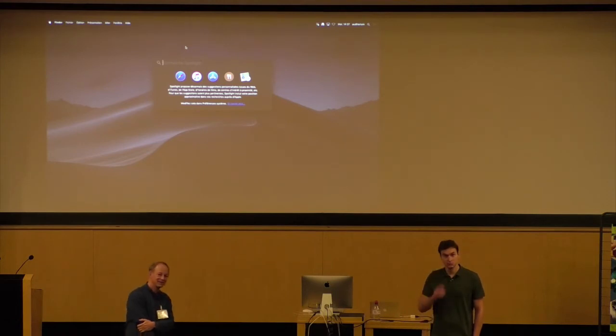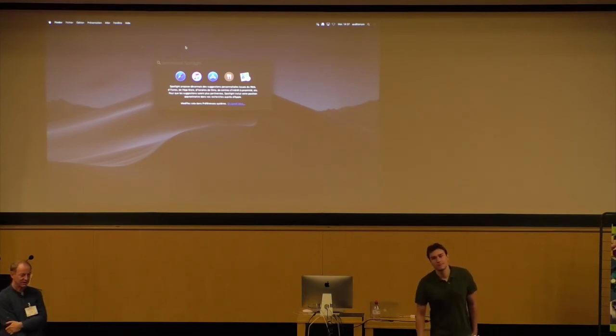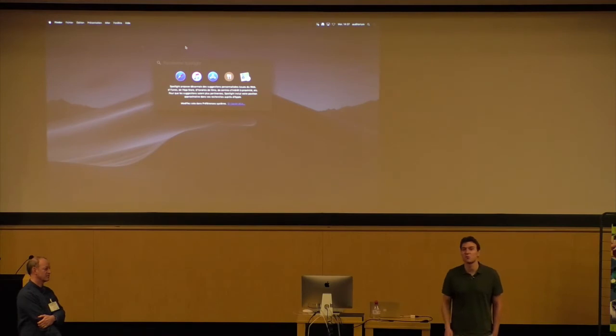Can you go towards time resolved freezing, so that you really are able to have a time series, or is it too long already? Longer I can go for sure, but shorter than this 360 milliseconds, as I said, it's hard at the moment. Then I need to adjust, but longer for sure. Longer I can do immediately, and then just having the grid at a dew point, so there is no evaporation at all. This would be possible. But shorter, not at the moment.